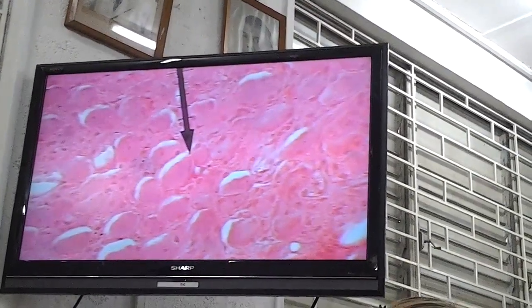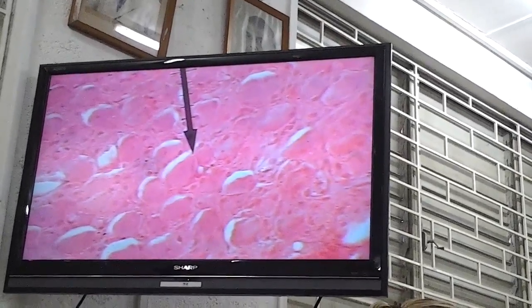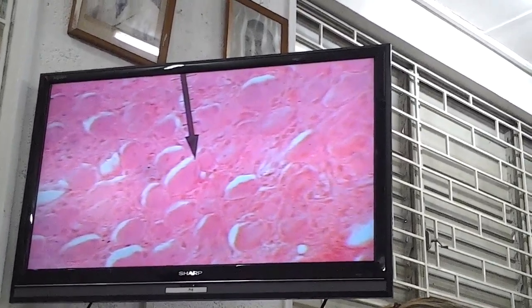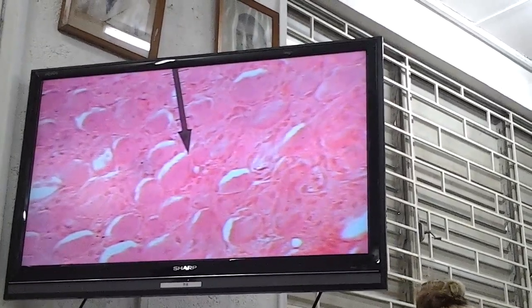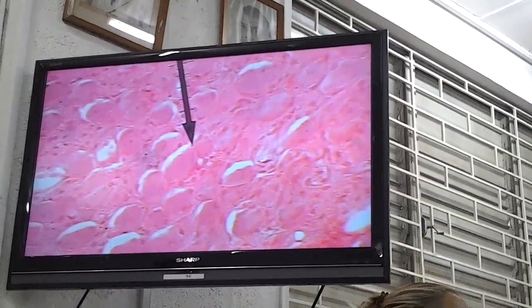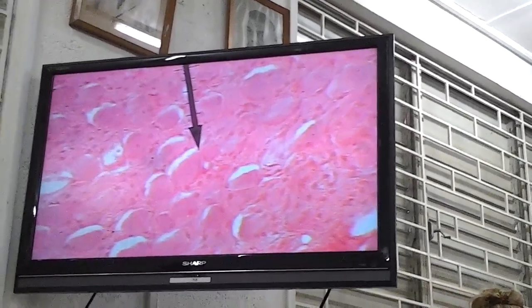So when you look down the microscope, all right, what are you looking at? Just don't worry what the pointer is at, but what are you looking at? And I think this is showing quite nice. Is it prostate? It's neuro? Neuro. Oh. So you're in the neuro section. I think dorsal ganglion. Very good.